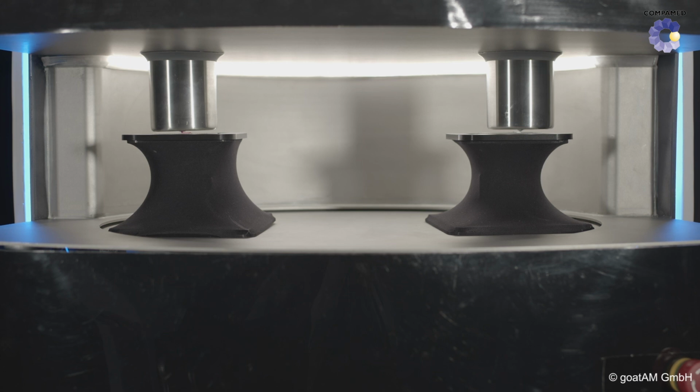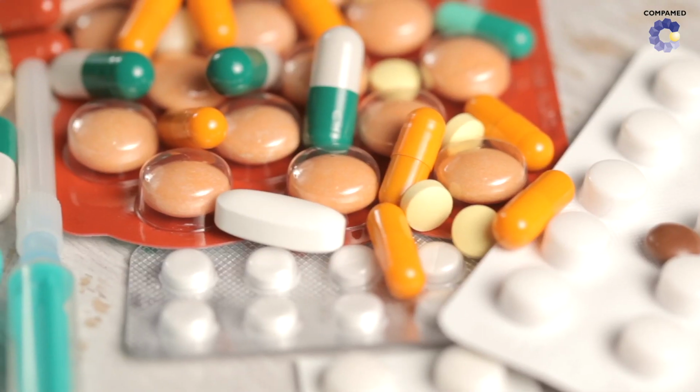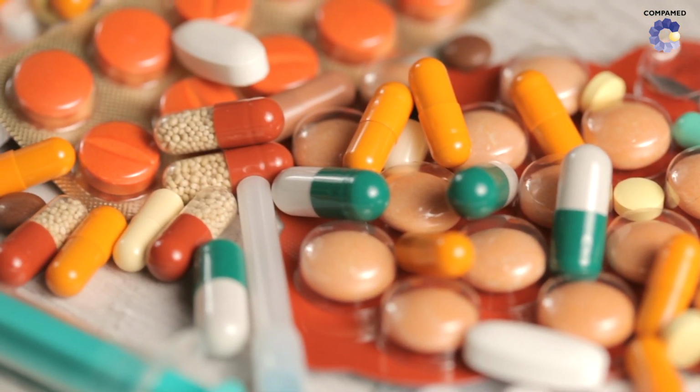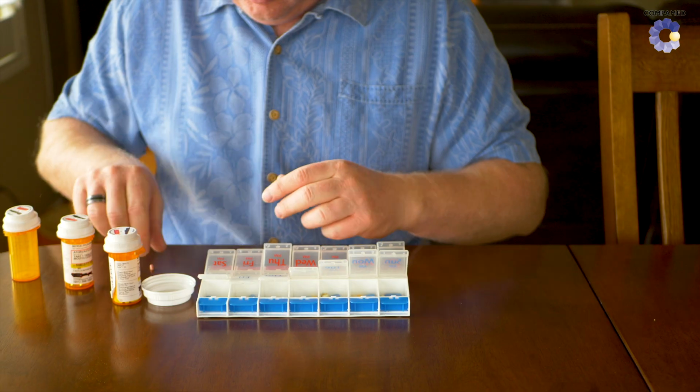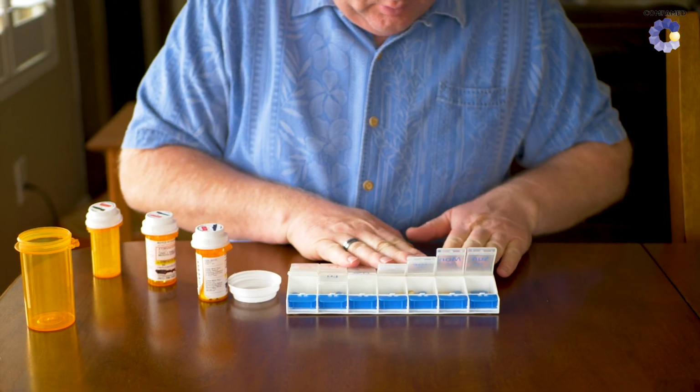3D printing now offers the possibility of changing the geometry, of freely changing the surface-to-volume ratio, which is also decisive for the release. These are all possibilities offered by this technology that can be individually adapted for patients, including geriatric patients, who have to take a large number of different active ingredients per day. The concept of the so-called polypill, in which several active ingredients that do not necessarily belong in one tablet from the outset, can nevertheless be combined to improve treatment adherence.